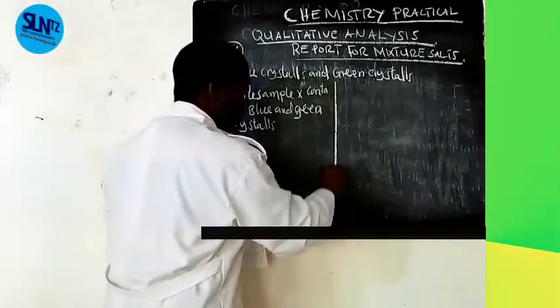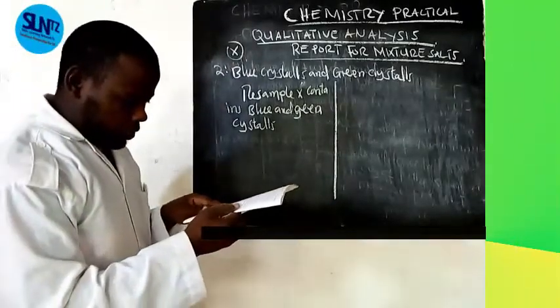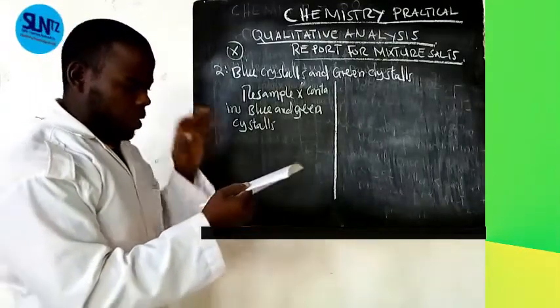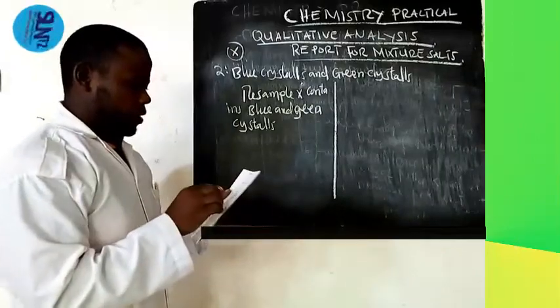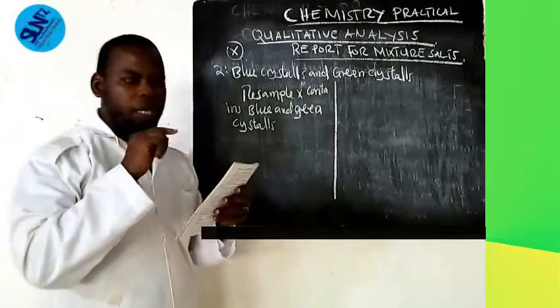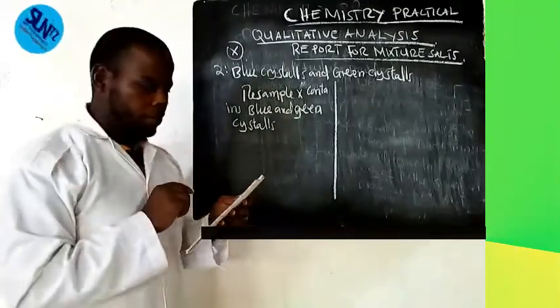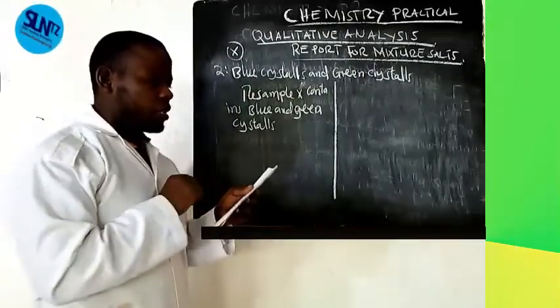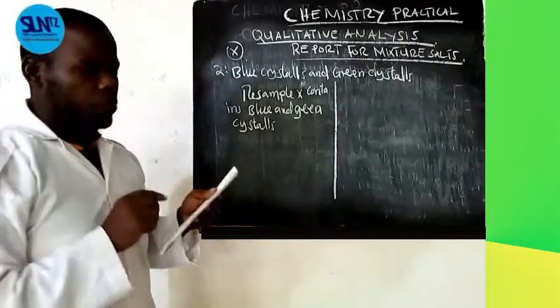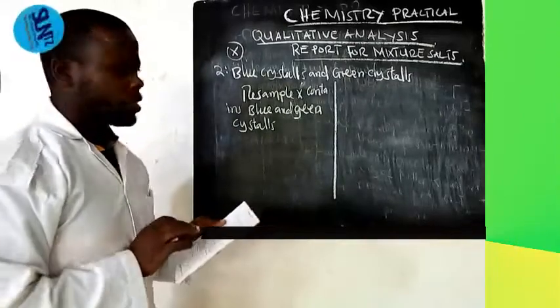Inside of inference, for blue there is copper, there is cobalt, but for green there is iron 2, nickel, chromium, and copper 2. Inside of crystalline there is nitrate, sulfate, chromate, chloride, oxalate, and so on, as you observed on that sheet.